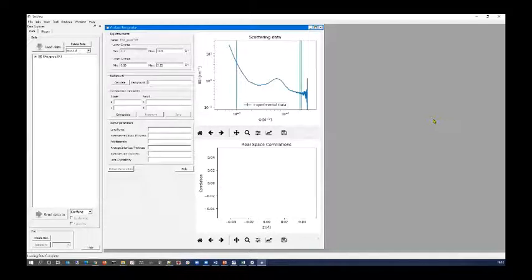And the thing about nylon and other polyamides is they are semi-crystalline polymers. So they have crystalline regions joined to amorphous regions, and that repeats throughout the structure. In a linear form, you've effectively got a quasi-lamellar structure in there, and that's what's giving rise to that peak. So that's actually a diffraction peak.